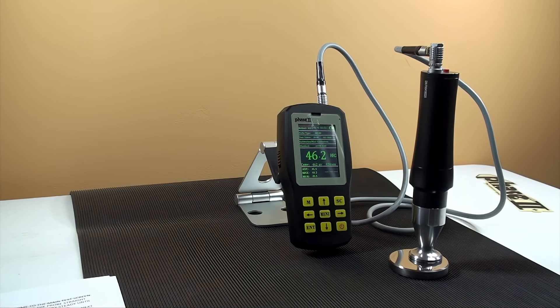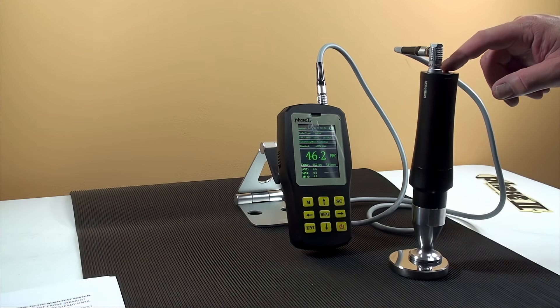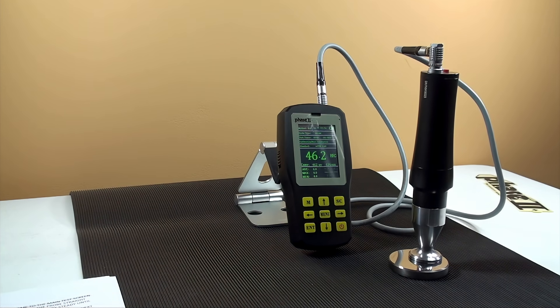The motorized probe will give you the most repeatable results since it eliminates the need to apply proper force. Place the probe flat on the surface of your part. The bottom of the probe is magnetized to help stay put on flat surfaces. Press the red button on top of the probe to start the test. Wait for the test result on the display before lifting it up and taking another test.